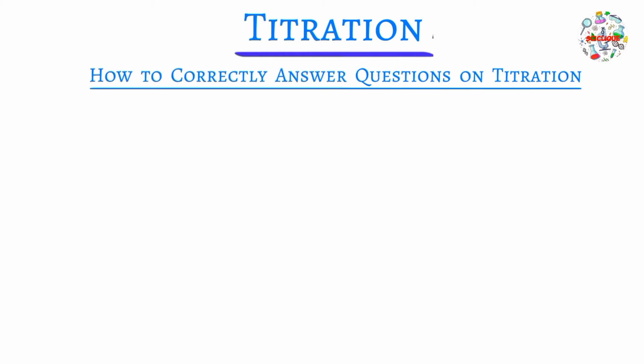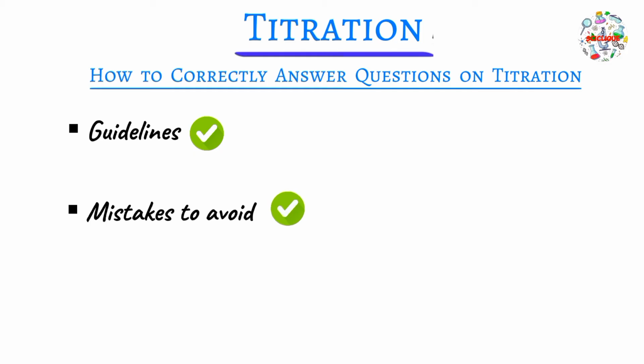Now, let's move on to the second part. In this part, we are going to discuss the following: guidelines on what is expected from you, the student, the mistakes that you should avoid, and how marking of titration questions usually takes place.